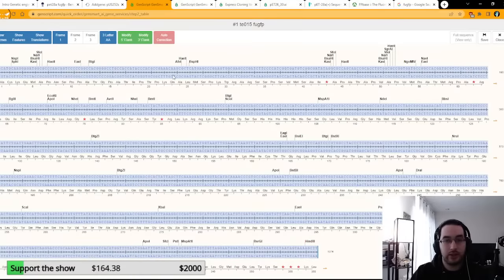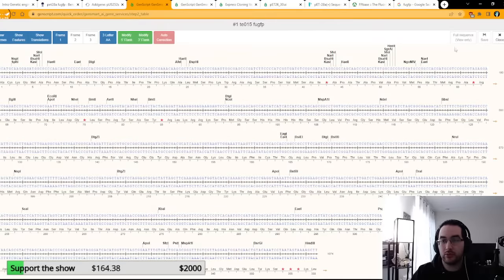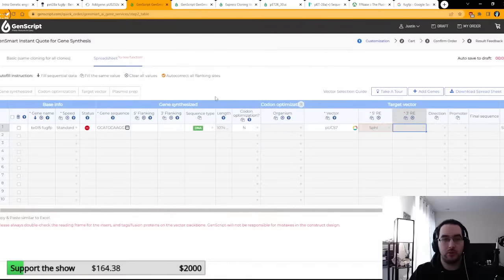It's really annoying. Do they detect it? Yeah, they do detect BglII, just for some reason, they wouldn't let us use that as our restriction site. Not entirely sure why. This should update in a second. I don't know why it hasn't. Close. Okay, there we go. So this has now been updated.